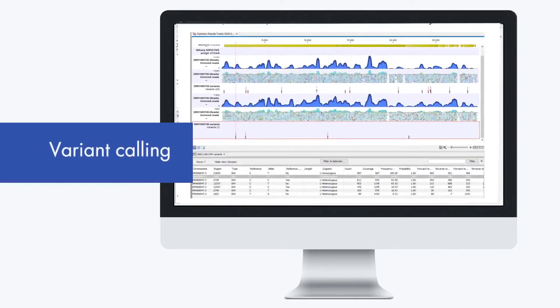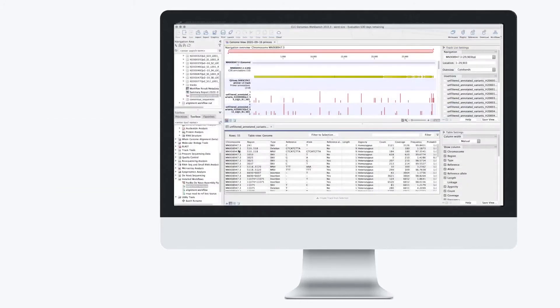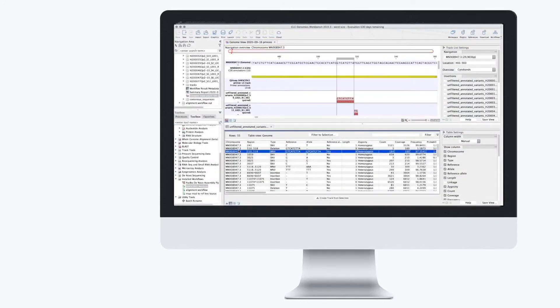And with our built-in genome browser, you can quickly visualize and confirm your results in no time at all.